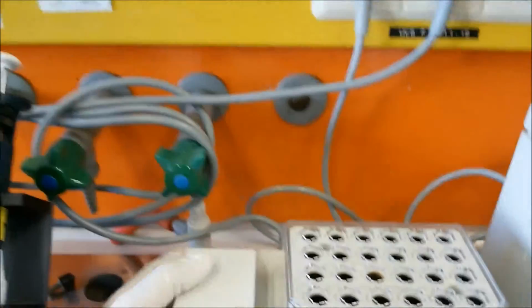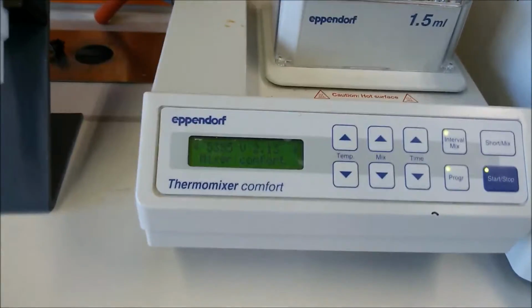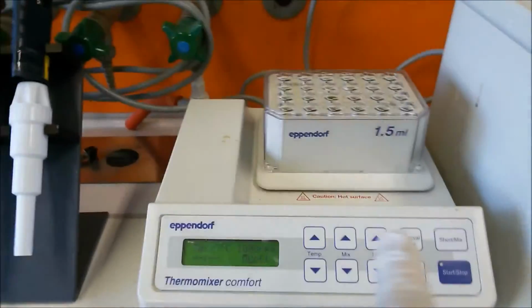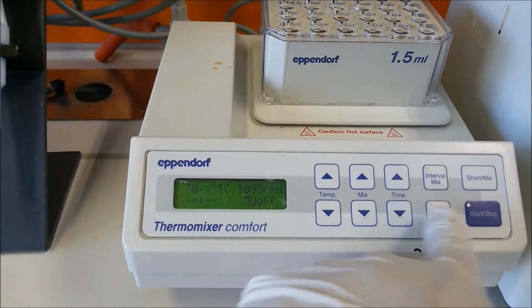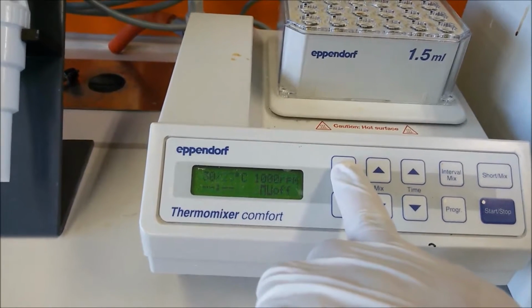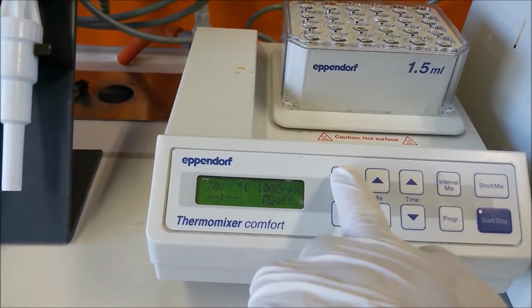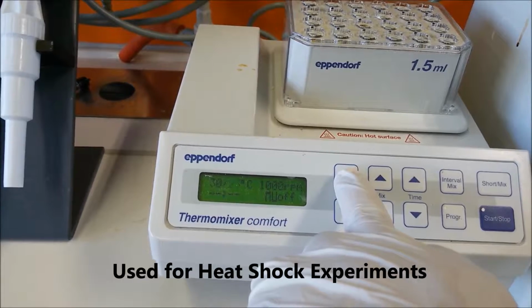Okay, so I have to switch it on. The knob is in the back. I switch it on, and now you will see the features. Okay, cool. So here you can see, you can set the temperature, time, and things like this. So for example, you want to give a heat shock in your bacterial transformation. So when we do the bacterial transformation, we have to give a heat shock at 42 degrees C for 30 seconds or something. If you know this, it's great. If you don't know this, we will tell you.